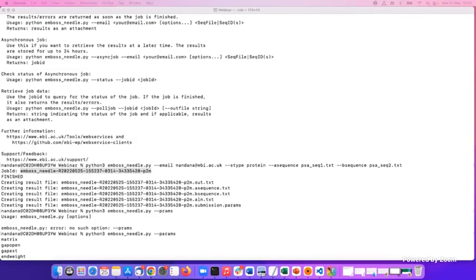Thank you. So we have another question. What is the medium large sequence, and when would you use MAFFT or MUSCLE? Okay. So, medium large, what I meant is, sometimes I have seen users who have very lengthy DNA sequences, and the number of sequences is also huge.